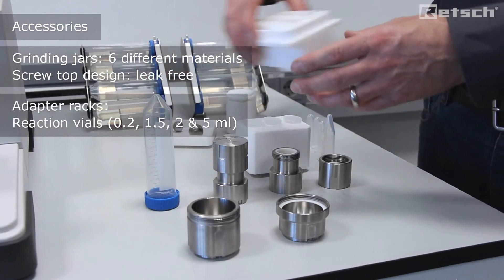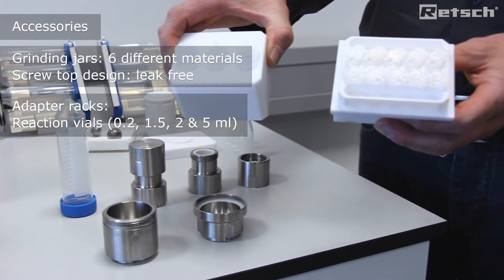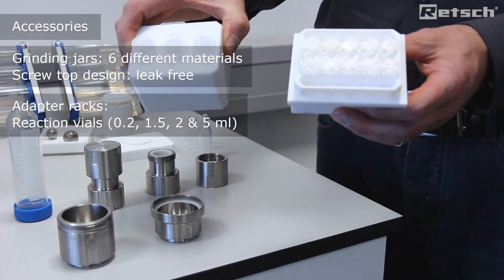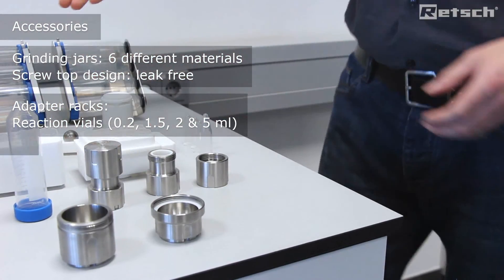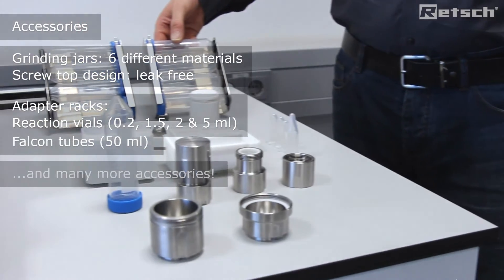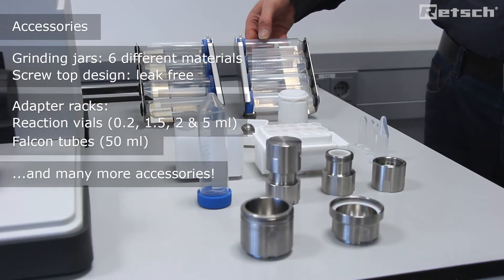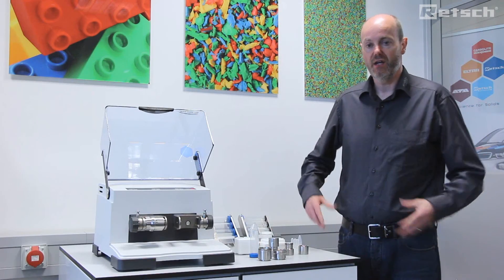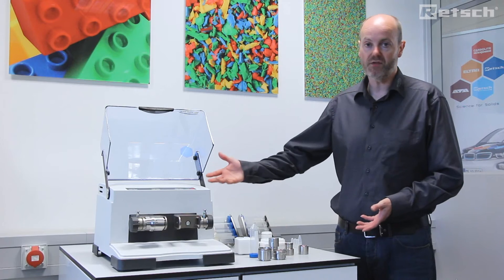Furthermore, we offer adapter racks whereby we can work in reaction vials both with two and five milliliter reaction vials. We also offer falcon tube adapters with 50 milliliter volume for various other application areas. You can see a very wide range of accompanying accessories for use on one single instrument.